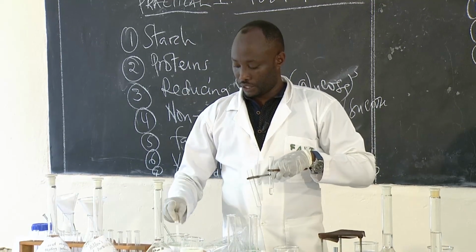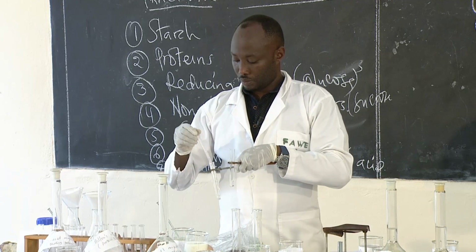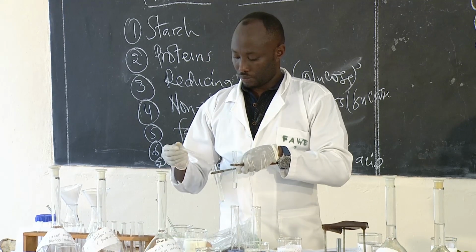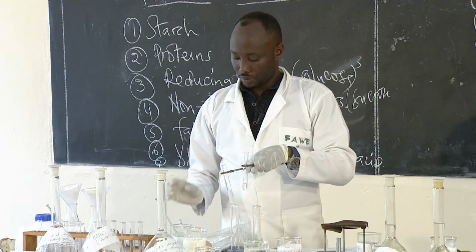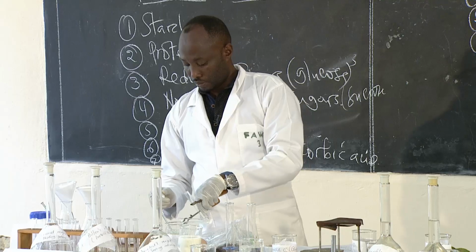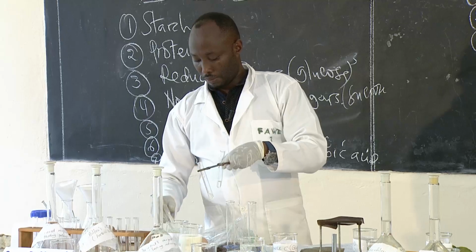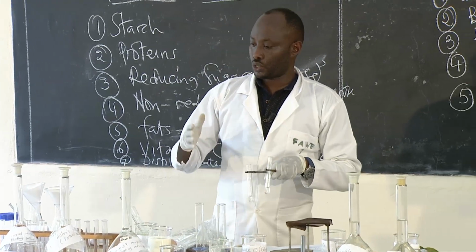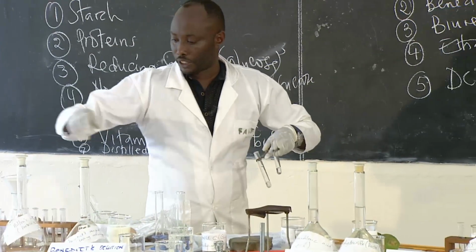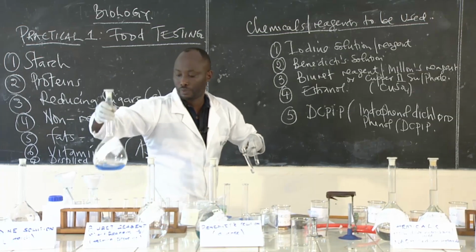Now let us see if it contains proteins. The same amount. I'm going to use a solution called the Biuret test. The Biuret test. Good.